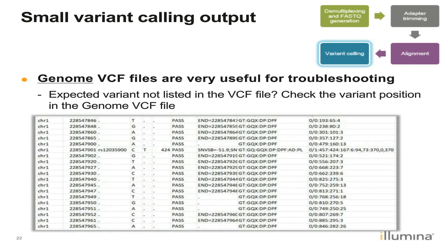Okay, so this is what a genome VCF looks like. And you can see it's pretty similar to the VCF we saw before. There are some differences here. I'll note in the ref and alt column, we see that for most of the alt, it's just denoted with a dot or a period. And this is just showing us that it didn't find anything different from the reference. We do see at the 6th position down, there's a T in the alt column. So what this is showcasing is that the genome VCF will include all of your variants that were called. It will just include a lot more information. So essentially, the VCF is a subset of the genome VCF.